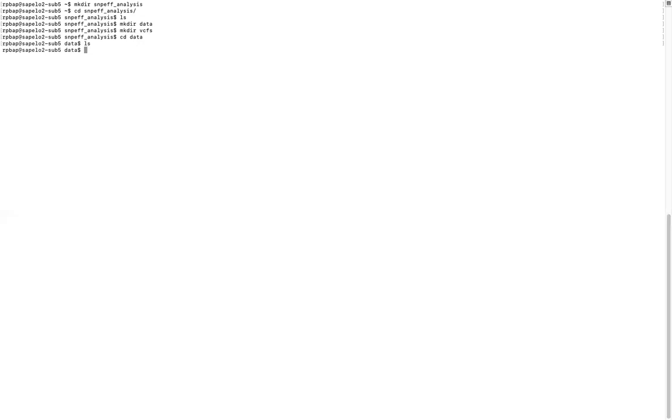Inside that folder, I want you to create two directories: one called `data` and another called `VCFs`. The `data` directory is where your database will be, and the `VCFs` directory is where your input VCF files from the script will be. Then do `cd data` to go inside the data folder — as you can see, it's empty. Create a new folder called `cpar_ATCC`.